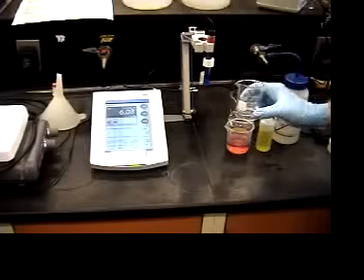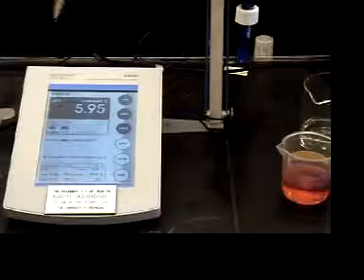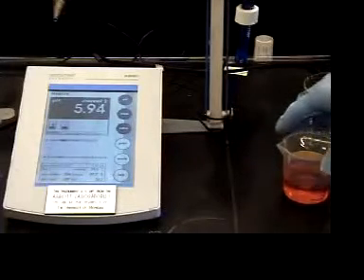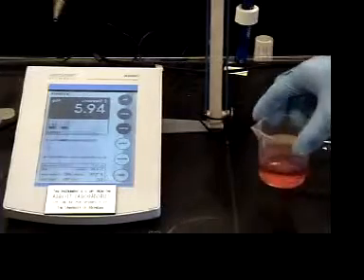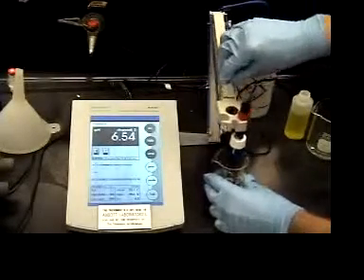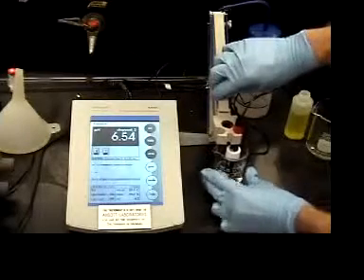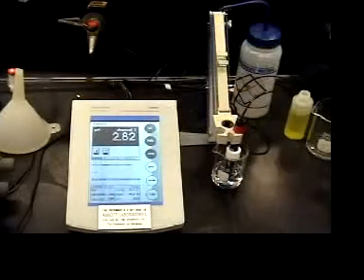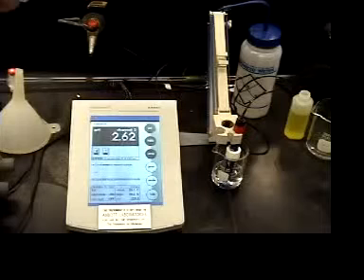This is the sample that we took from the CSTR. You should always calibrate your pH meter before you run the sample. Now dip your pH probe into your sample and press measure. It'll beep once it's stabilized.